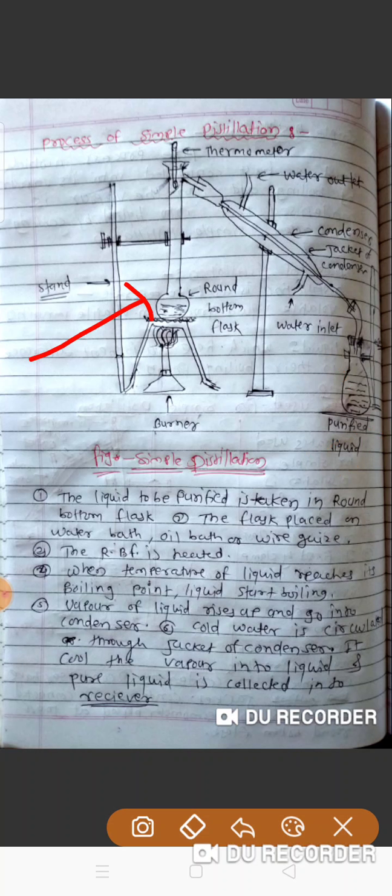The round bottom flask is fixed to the stand with a clamp and placed on the water bath or oil bath. The round bottom flask is heated using the burner. When the temperature reaches the boiling point, the liquid starts to boil and is converted to vapor.